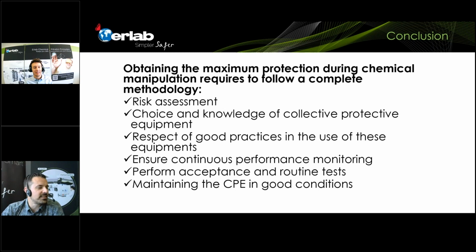Well, I think I remember that mercury is not a product that is filtered by our filters. So if in your country it's not allowed to use it in a ducted fume hood, I'm afraid it cannot be used in ductless fume hoods either, because it's not filtered by the molecular filters that we developed.